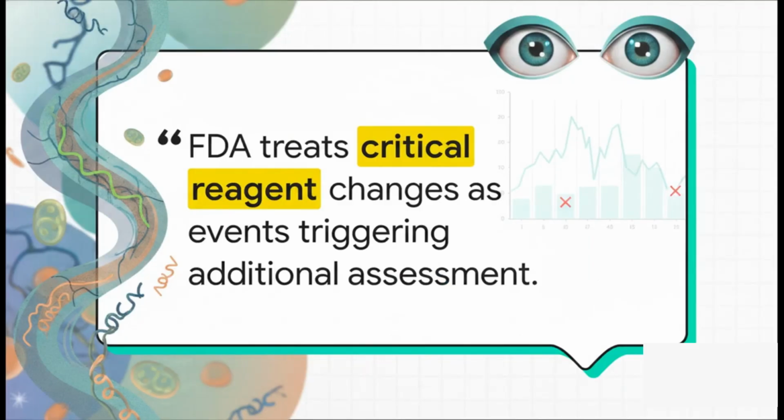And we absolutely have to do this because regulatory bodies are watching closely. The FDA and ICH M10 guidelines actually agree that same reagent, new lot does not mean same assay behavior. We're dealing with critical biological materials here. Their performance is going to shift. That's exactly why lot changes must be handled as planned comparability exercises, not after-the-fact frantic investigations.